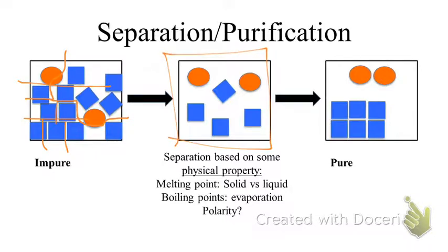So that's a good idea, except how hot do you think we're going to have to get all of our compounds up into a gas state? Incredibly high. Another further complication behind that: we're all made of organic compounds. If we try to melt or even turn ourselves into the gas phase, does that work really well? No. We kind of combust, react, turn into CO2, other things other than ourselves. We can't really do that with organic molecules. They'll decompose too readily. So we have to come up with a more mellow way to get them to separate.